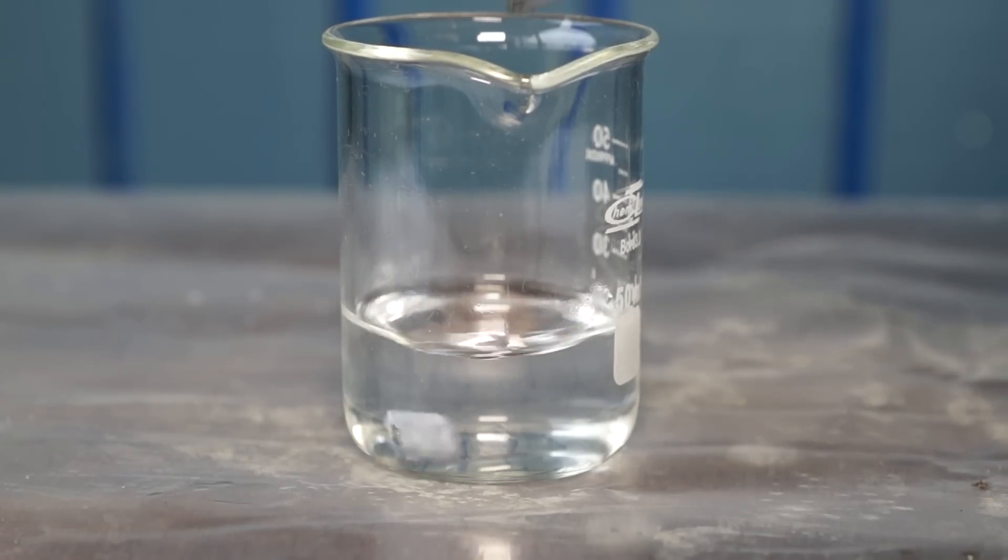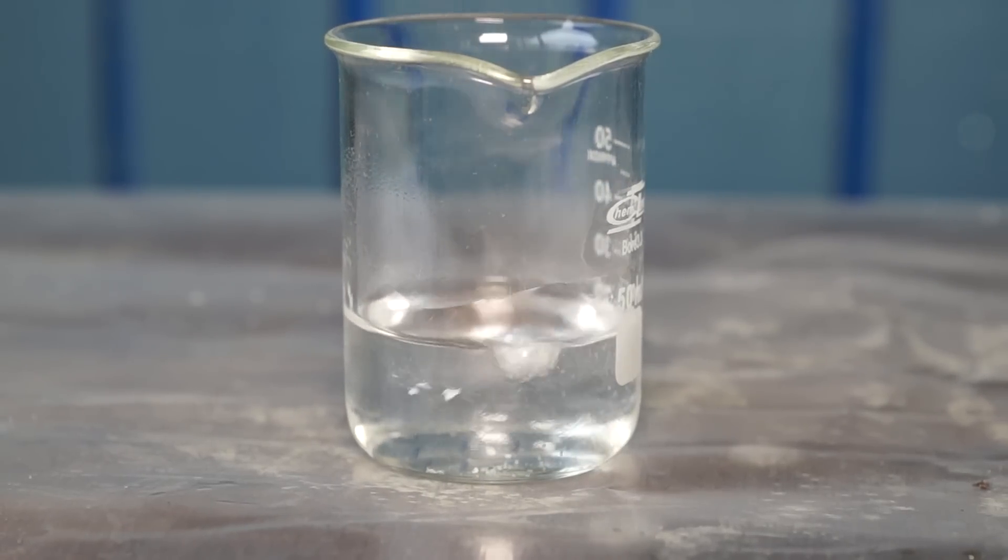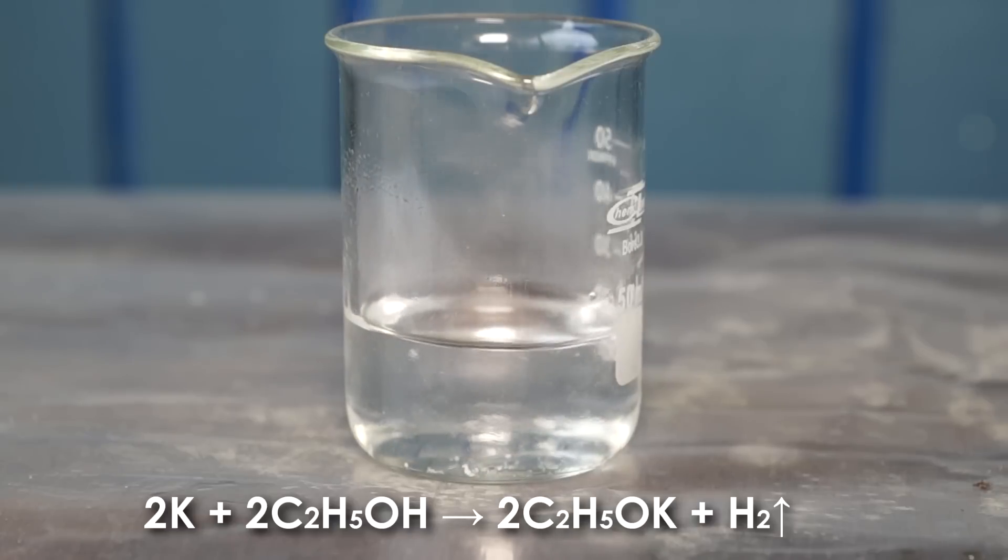In the last experiment, I took a small piece of potassium and put it into a cup with ethanol. Potassium rapidly dissolved in ethanol to form potassium ethanolate and hydrogen.